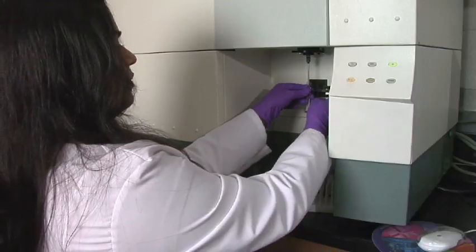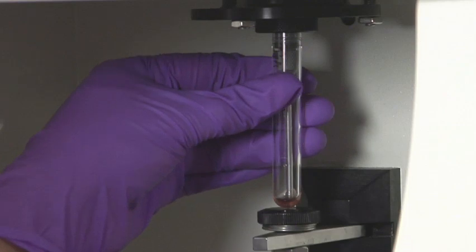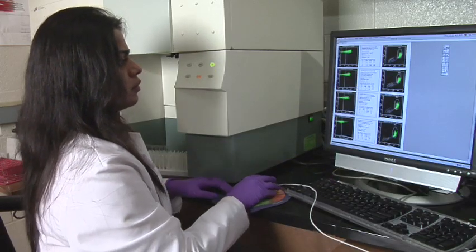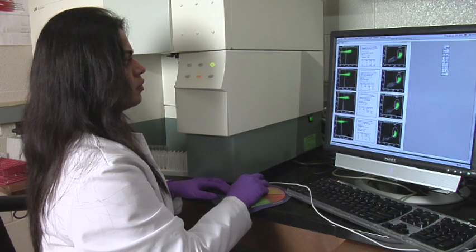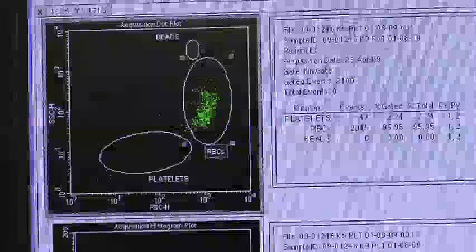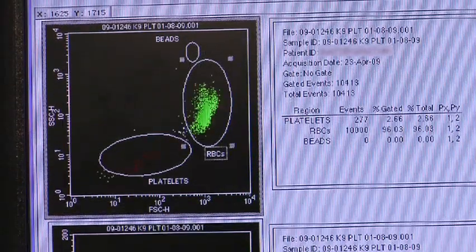By detecting fluorescent dyes bound to specific cell surface proteins, flow cytometry is valuable in the detection of conditions such as leukemia and lymphoma. In the case of surface proteins, there are no other tests that are done to detect them other than the flow. When it comes to the veterinarian making his decision or his diagnosis, he can rely on the results of the flow because of its high sensitivity.